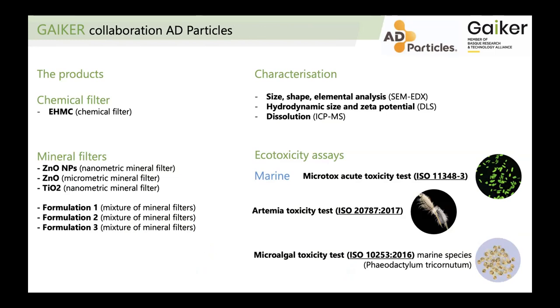To characterize these materials, we use SEM coupled with EDX for size, shape, and elemental analysis. We also used DLS for hydrodynamic size and zeta potential, and also ICP-MS for dissolution. For the ecotox assessments, we used basically marine species. So we used the Microtox acute toxicity test based on this ISO, the Artemia toxicity test based on the ISO here listed as well, and the microalgae toxicity test using Phaeodactylum tricornutum.